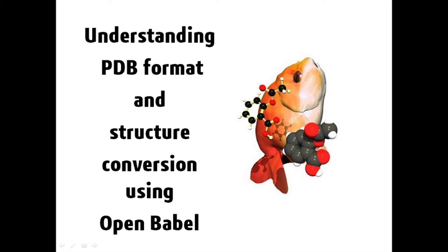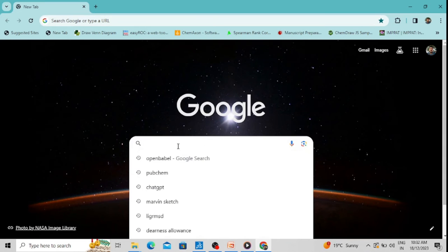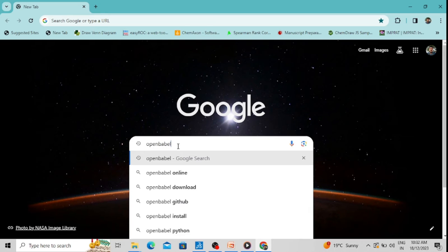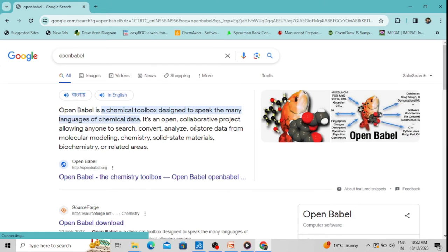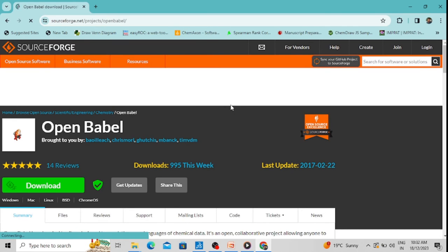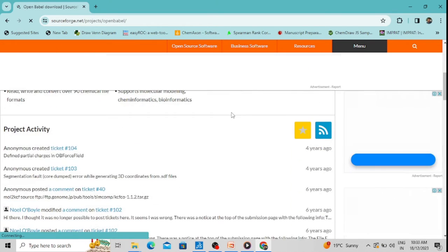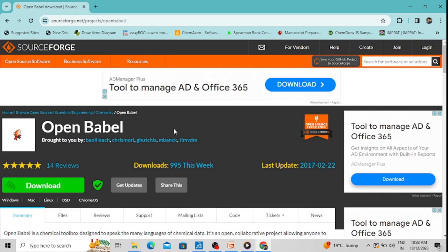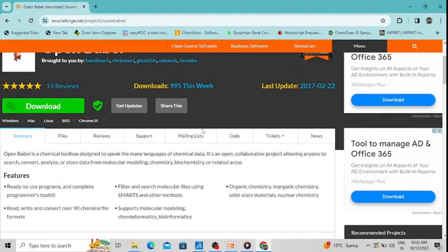We can also convert structural file formats from one format to another — for example, from MOL to PDB or PDB to SDF. There is a very good software for that purpose called OpenBabel. You can download OpenBabel from the web — simply type 'OpenBabel' in Google. It is available for Windows, Mac, or Linux, and has both a graphical user interface (GUI) version and a command line interface.